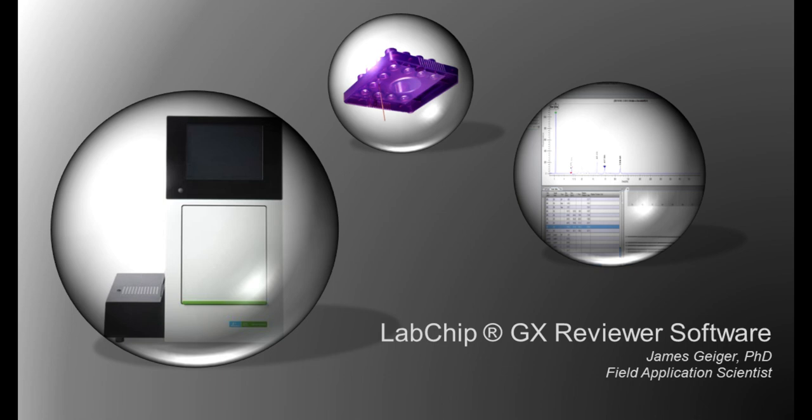Hello, my name is James Geiger, and I'm an application scientist with PerkinElmer, and I'm going to show how we are going to get the most out of our Labchip reviewer software today, and hopefully this will help you streamline all of your data analysis moving forward.